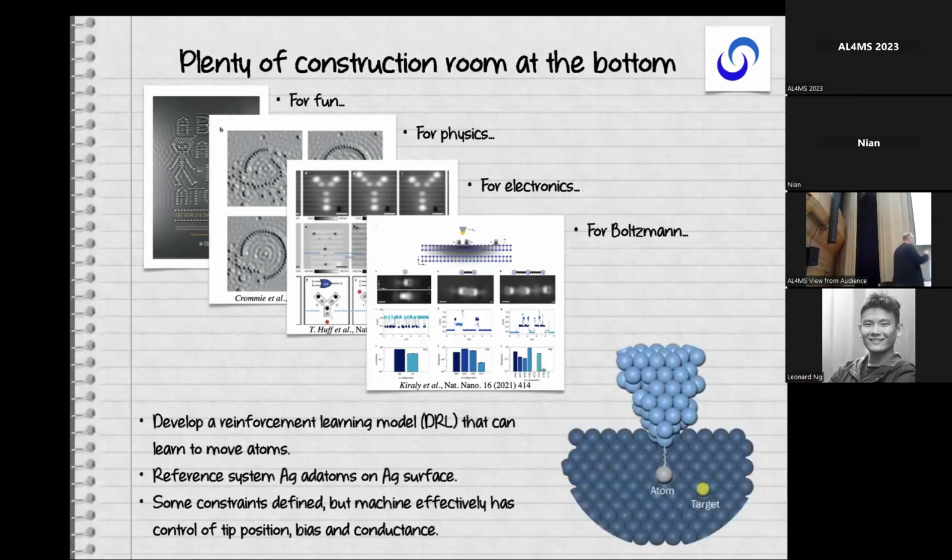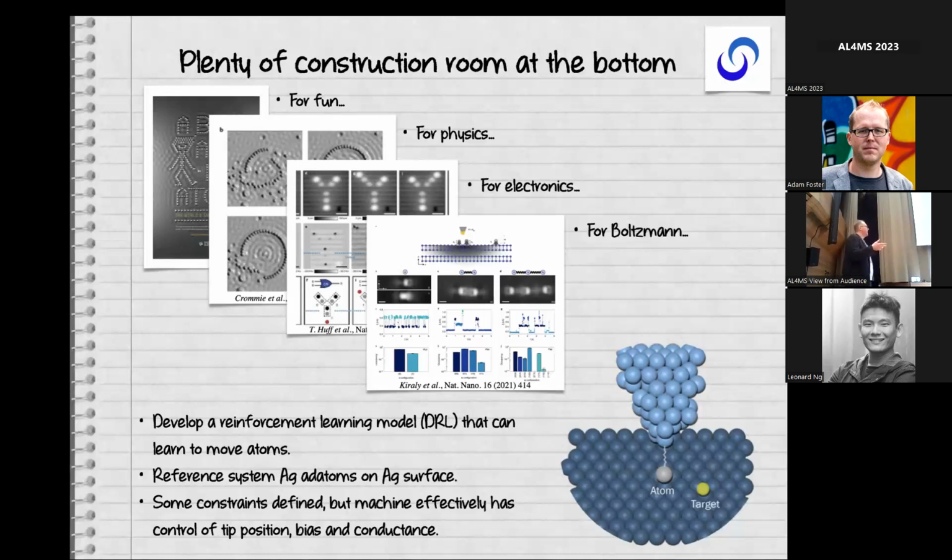So we said, could we do this, but now take away the pain, at least from our perspective as theorists? We assume experimentalists don't want to waste their time with repetitive tasks. Could we do this with a machine learning agent, a reinforcement learning agent? We sat down with the experimentalists, they were interested, and of course we picked the simplest possible system to start. So this is a proof of concept.